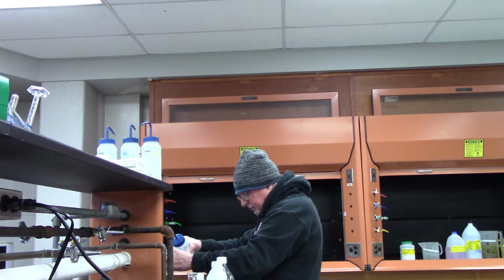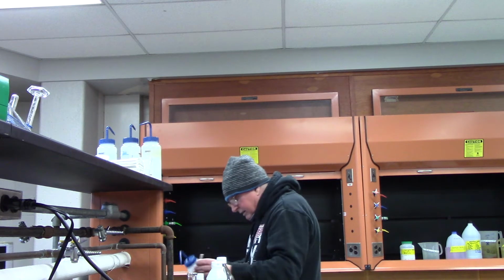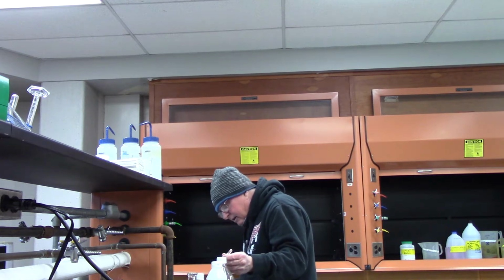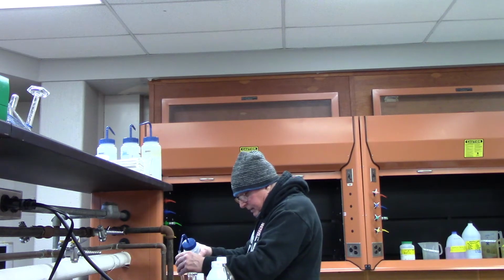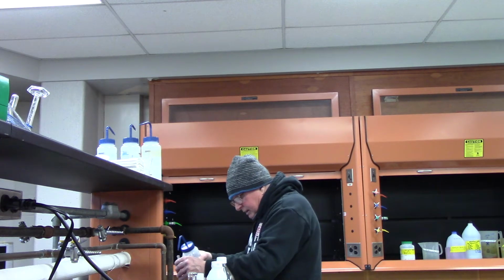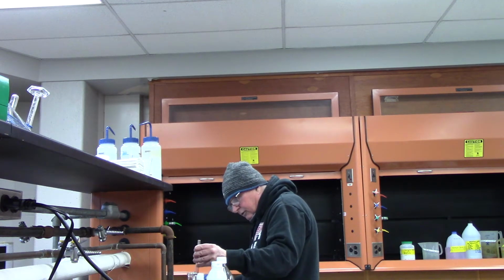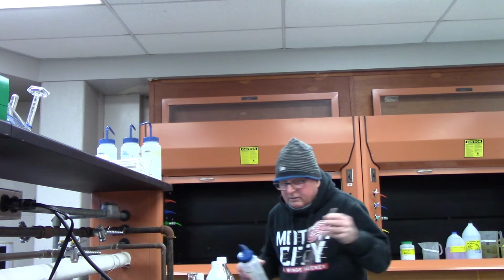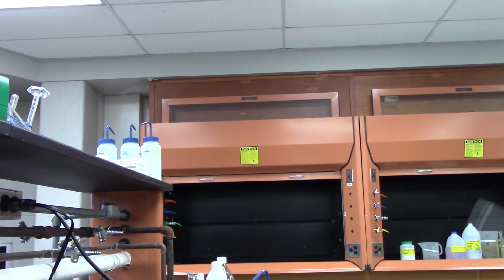And then the key is to really try to be precise and rinse things out as much as you can. You're trying to not have contaminations or previous concentrations affect anything in the future. All right, so hopefully that does the job. Set that aside.